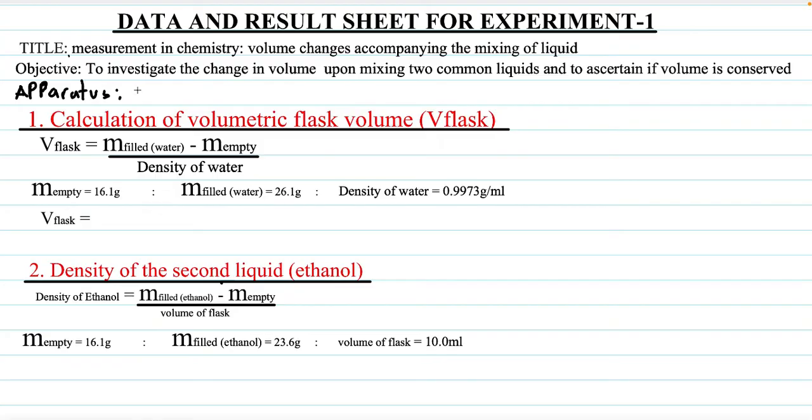Of course, we have Erlenmeyer flask, we have volumetric flask, we have beaker, we have pipettes, we have weighing balance.